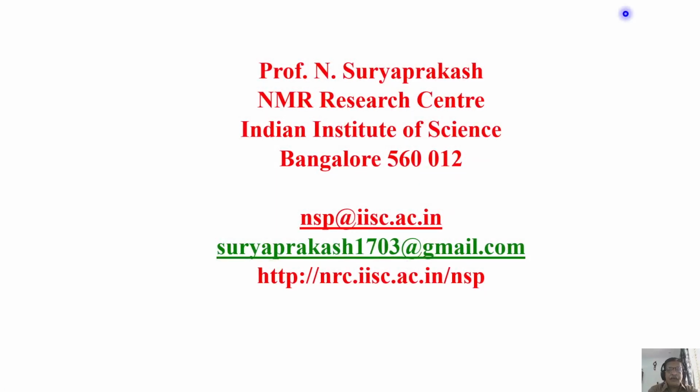Welcome back. In the last couple of classes, we extensively discussed proton NMR spectra, analysis of proton NMR spectra, carbon 13 NMR spectra, its analysis, and editing of the carbon 13 spectra based on the number of protons attached to different carbons by carrying out experiments called DEPT 90, DEPT 45, DEPT 135, like that.